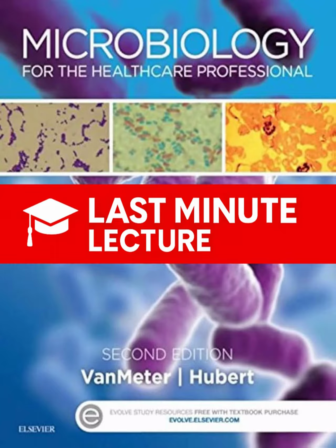Absolutely the cornerstone. Aseptic technique is this super strict set of rules. You do it under sterile conditions. And the whole point is to stop unwanted microbes, contaminants, from getting in your sample or the lab or even onto you. That sounds intense. Like creating a tiny sterile bubble in a world full of microbes. How does that actually work? How do you control something like just the air?